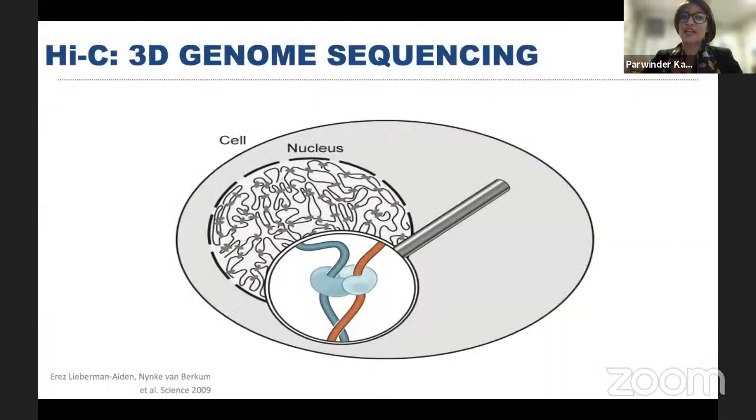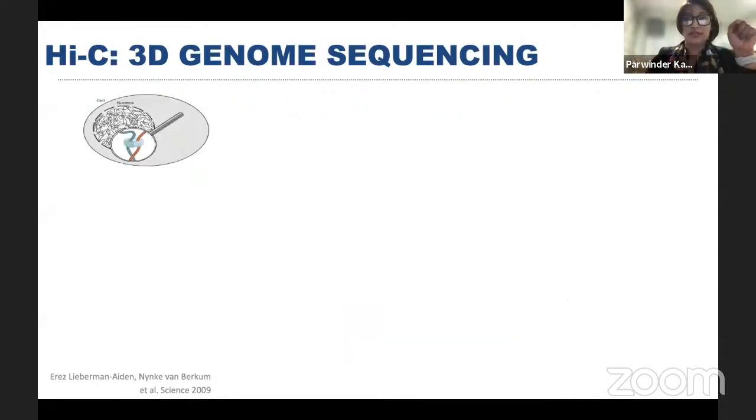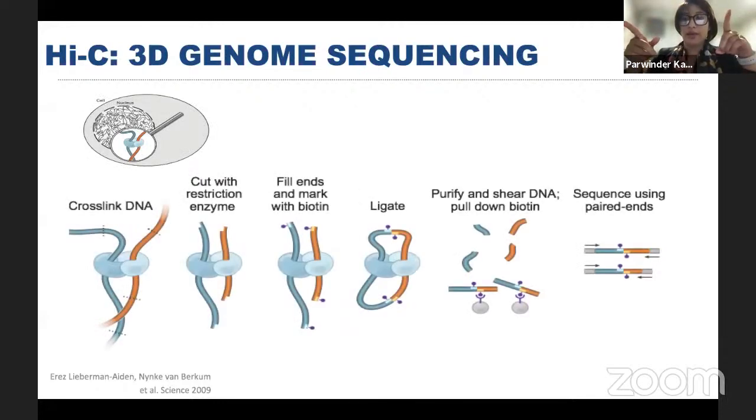So Hi-C is high throughput chromosome conformation capture, right? What this does is link the data: you cross-link the tissues, okay, before you extract the DNA. By cross-linking the tissues, you're kind of taking a photo in time. You're flash freezing. It's just like taking a photo of DNA. And as soon as you take that photo, you can cut it with the biological scissors, which are also called restriction enzymes. You can fill in with some sticky liquid, which can ligate the two ends together. And then you can pull that out and run high throughput next generation sequencing.